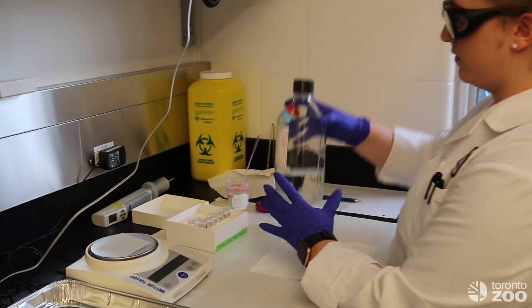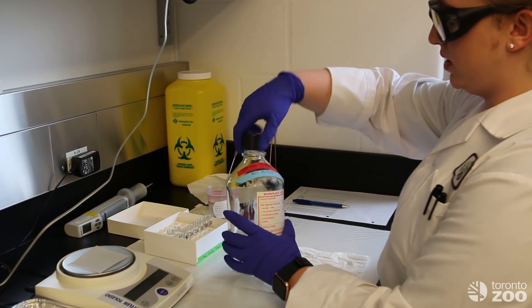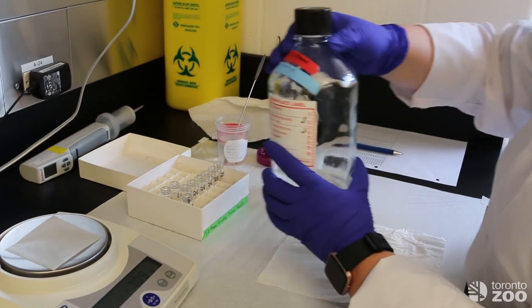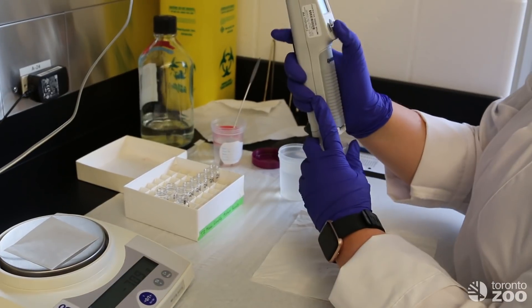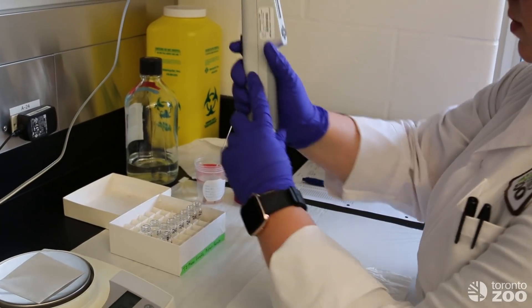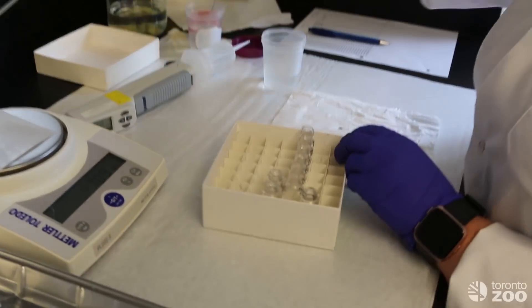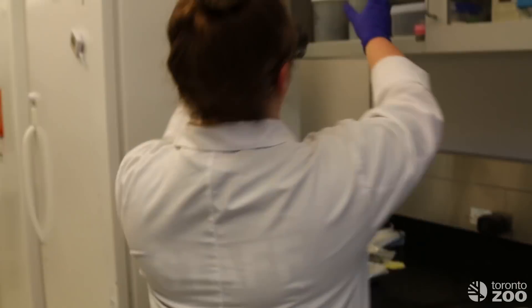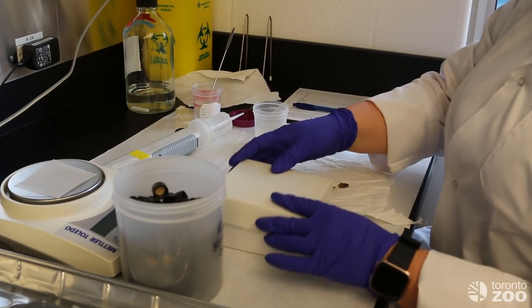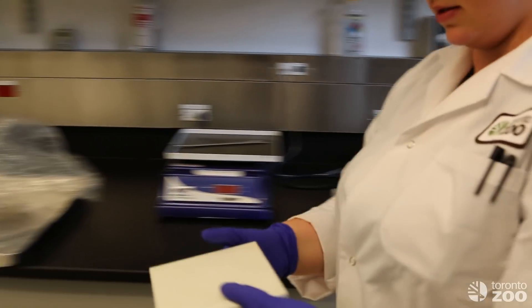The next step, once we have all of our samples weighed out, is we are going to add 80% methanol, which is what we use to extract the hormone out of the feces. And then we will take it over to the next step — our vortex — to mix the sample.